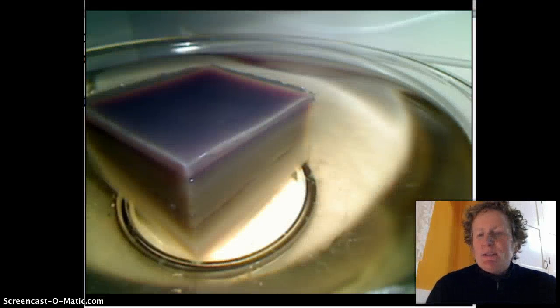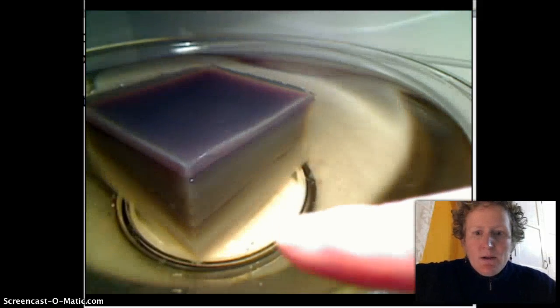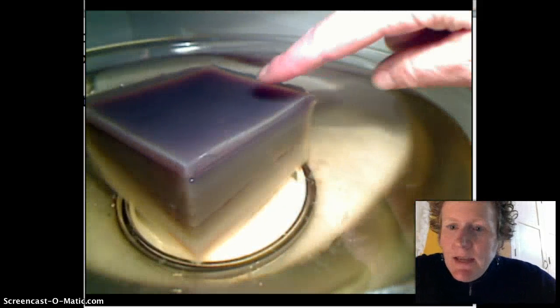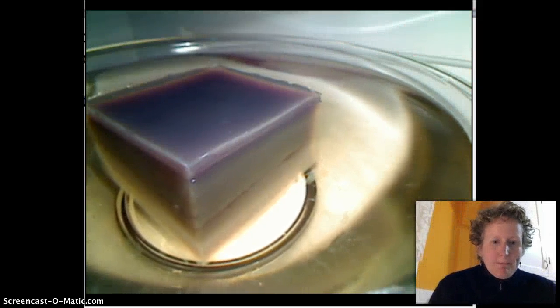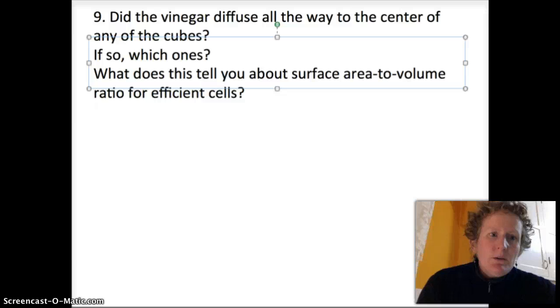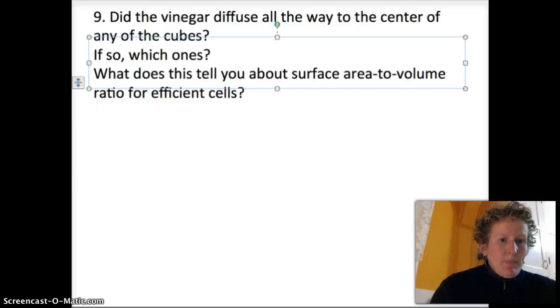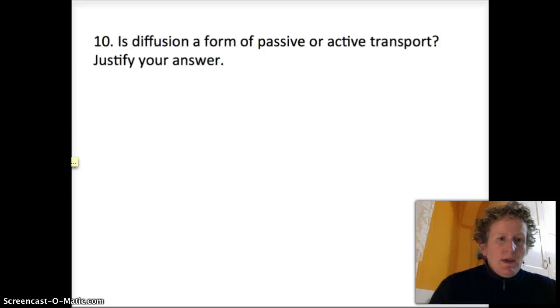In contrast we haven't made much progress with the 10 by 10 by 10 centimeter cube. It's still pretty purple. So for number nine we know that small cells are really efficient because they diffuse quickly and big cells not so efficient. The rate's the same, it just takes longer to drive across Texas than it does across Rhode Island.